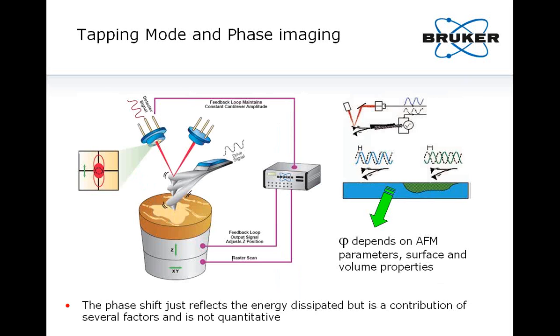So before we jump to the main topic of the talk, which is PeakForce Tapping and PeakForce QNM, I would like to remind you the main differences between the existing AFM techniques to measure mechanical properties of the samples. So the first one is tapping mode.